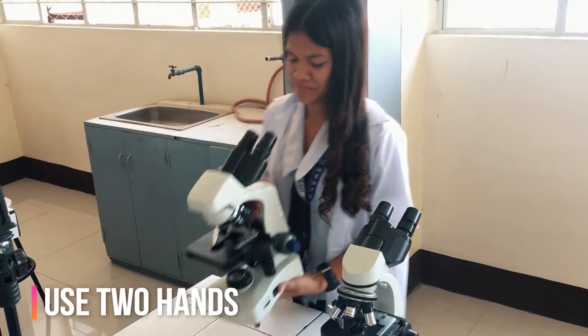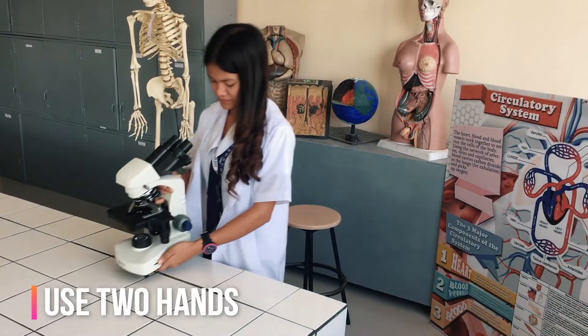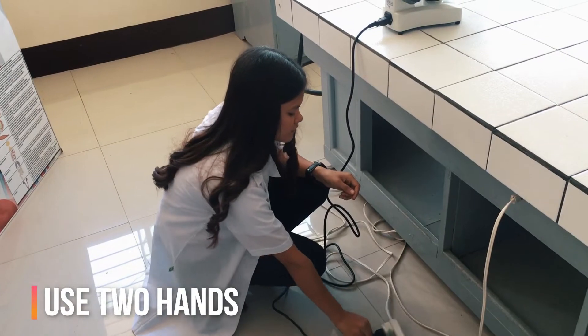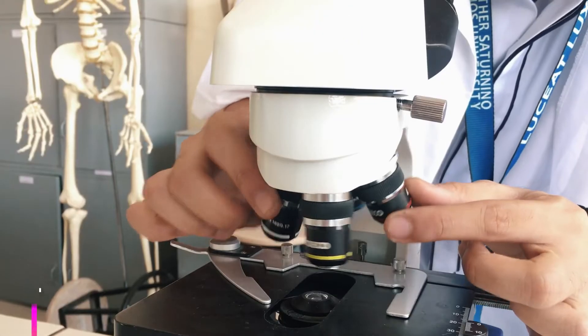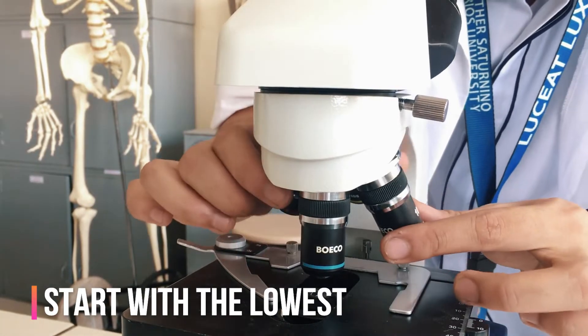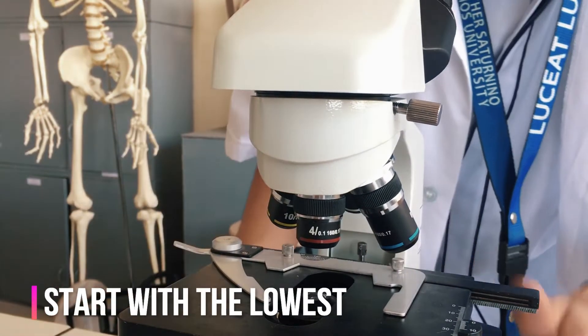When moving your microscope, always carry it with both hands. Grasp the arm with one hand and place the other hand under the base for support. Turn the revolving nose piece so that the lowest power objective lens is clicked into position — it is also the shortest objective lens.